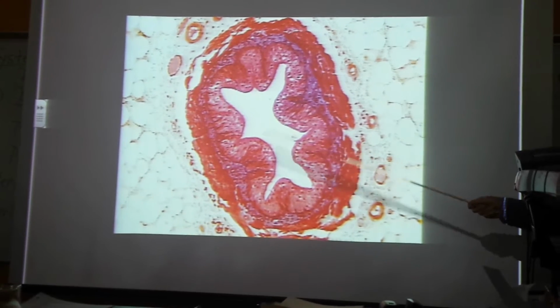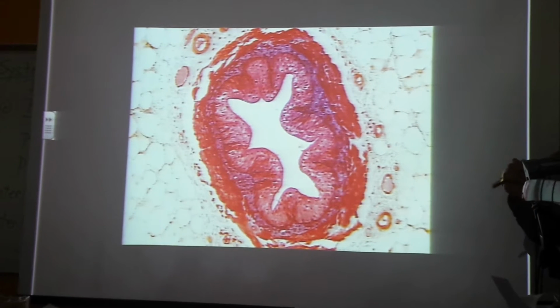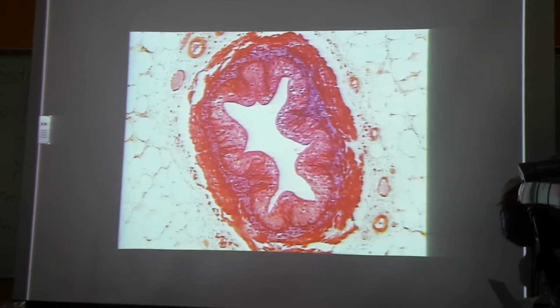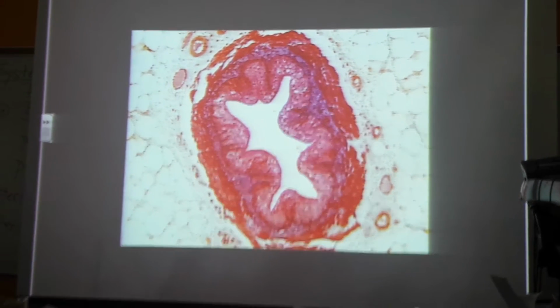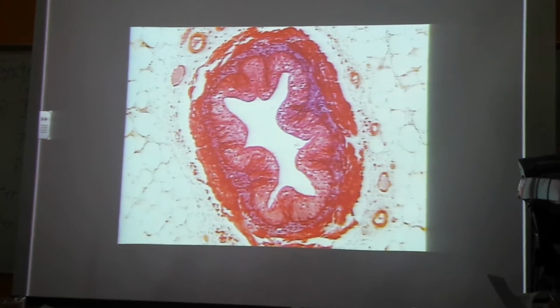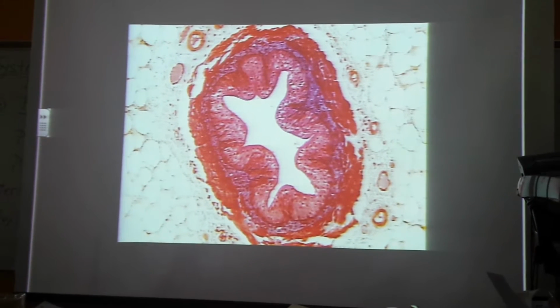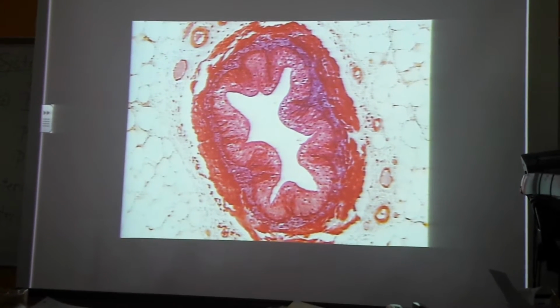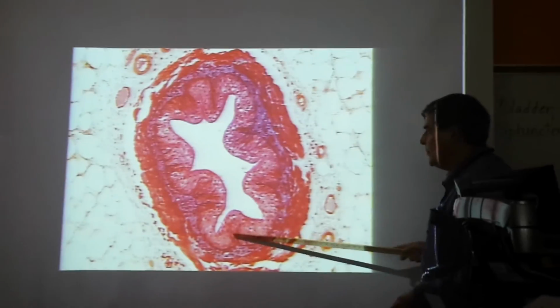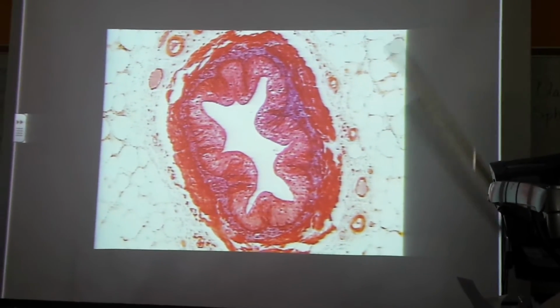The epithelium is listed there in your handout. It's transitional epithelium. What do we mean by that? It changes in between. It changes shape according to the pressure put on the organ. Here, where there's no pressure, no urine passing through, it looks like a stratified cuboidal epithelium. When urine passes through and distends or stretches the wall, it stretches and looks more like a stratified squamous epithelium. Okay? So again, this is transitional epithelium. It lines the ureter, also the urinary bladder, and part of the urethra as well.